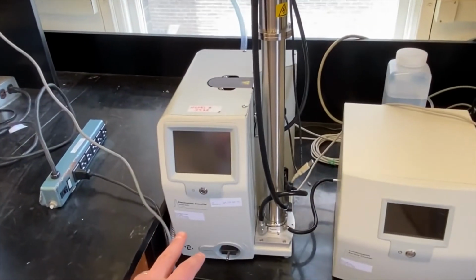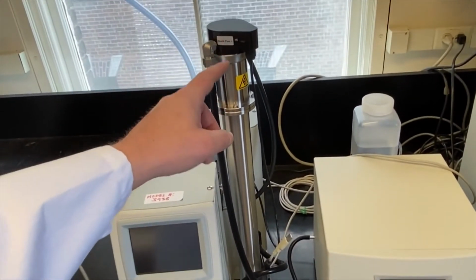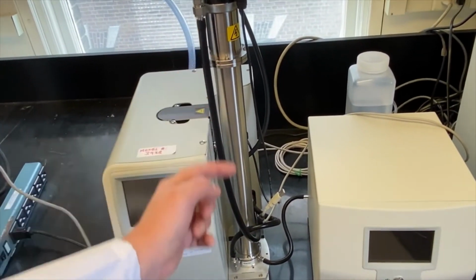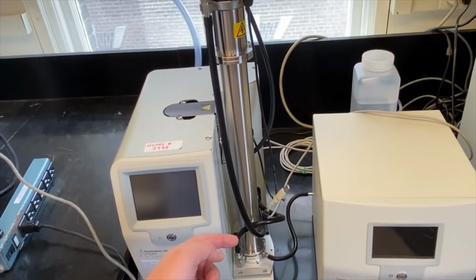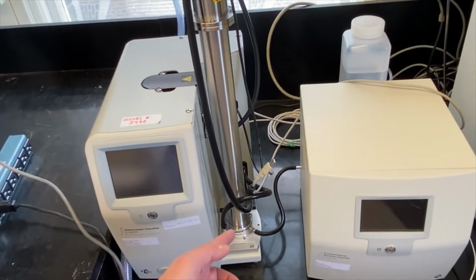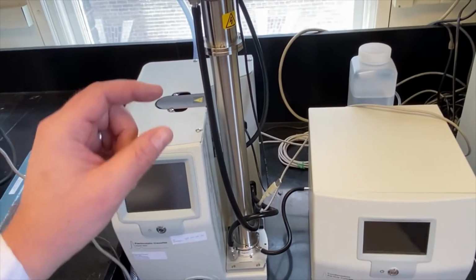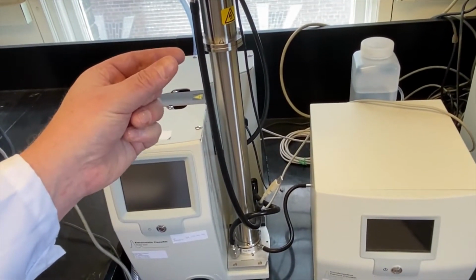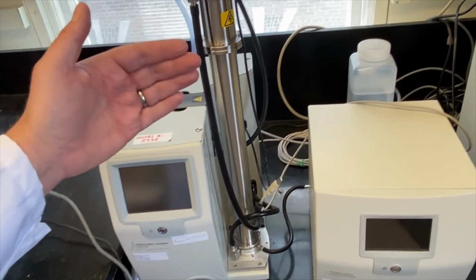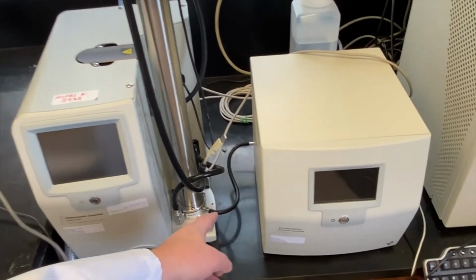The differential mobility analyzer basically consists of a pump and a computer, and then a long tube through which air is passed. The air is in a cylinder, and down the center of the cylinder is a charged rod. The charged rod changes voltage as air is passed through it, and then a tiny little hole allows air to be pulled off the tube. What this effectively does is it draws particles close to the rod according to their size. So as the charge on the rod changes, it allows different size particles to be emitted through this tube.